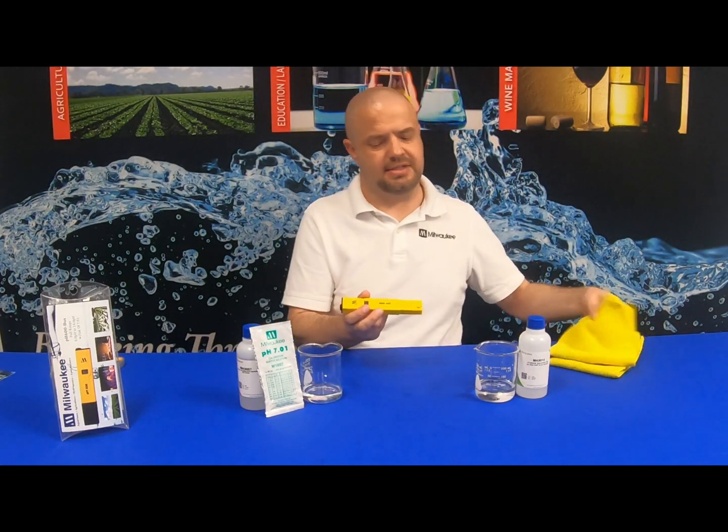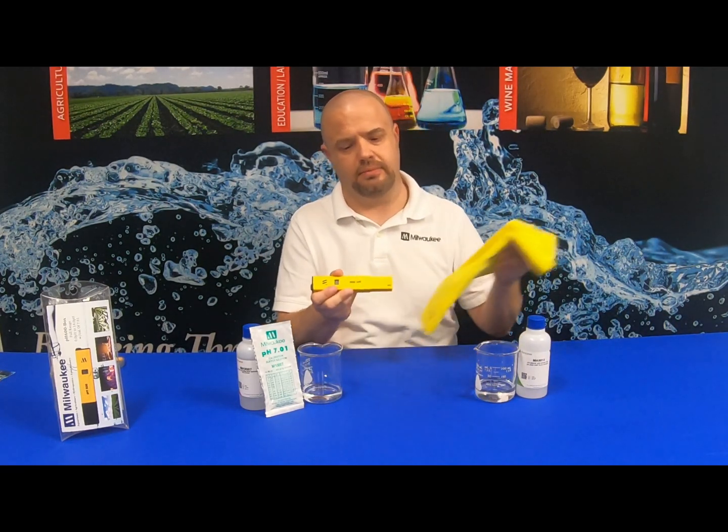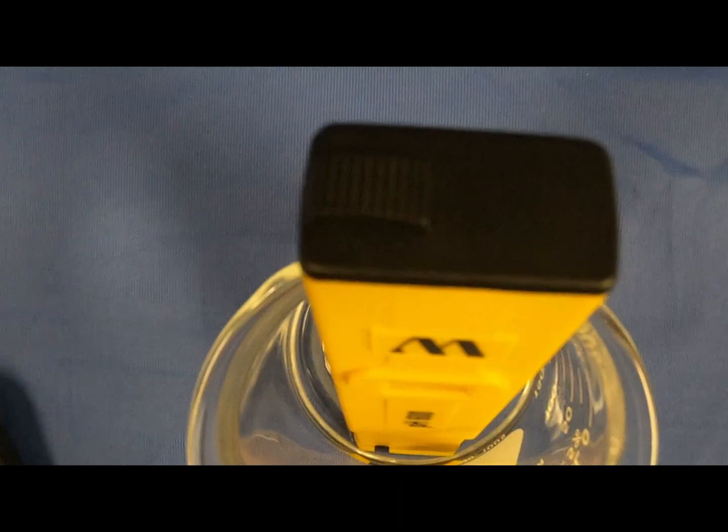We'll begin the calibration procedure by removing the PH600 from the storage solution. Shake off any excess solution, then take a towel and wipe it dry. You will then slide the button on top to power the unit on.